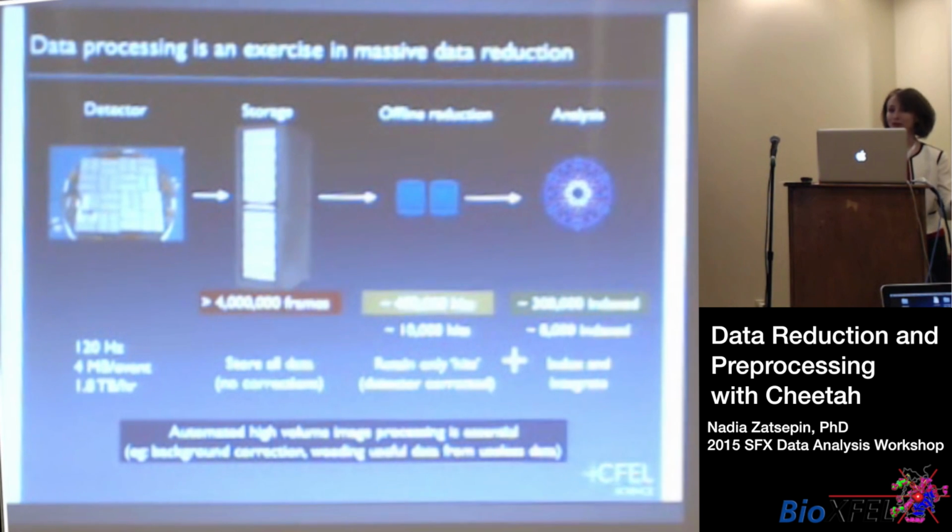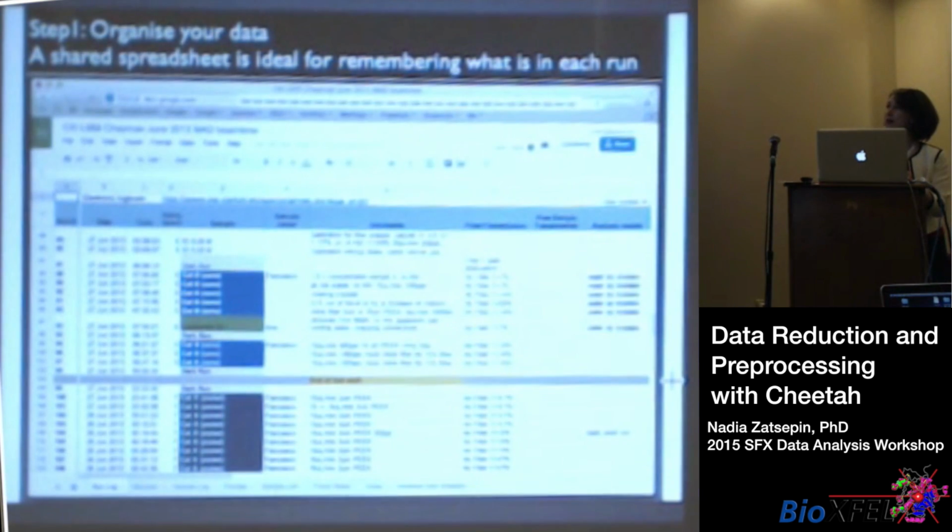And with good geometry, which I will mention, and I'm sure Tom will mention again, and with a good sample, you can index about 80 or 90% of these. So that's really good. We still need really, really good structures. As John said, in the olden days, we would need tens to 100,000 patterns. With a lot of improvements along the way from detector geometry and especially the indexing, merging, and evaluating steps, we can now work with a handful of thousand patterns.